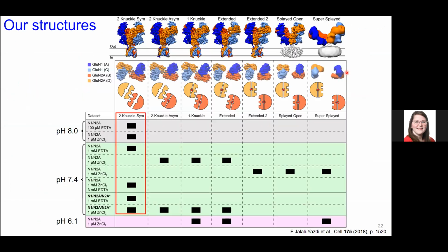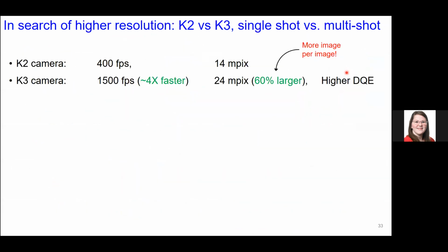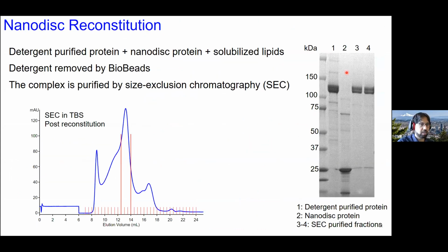Another question was, how efficient is the nanodisc incorporation? Say, are 80% of receptors successfully embedded? Good question. I think what I found throughout doing this several different ways is that about 50% of receptors incorporate into the nanodisc. And that includes all the losses that I gathered throughout this process, because normally I do affinity purification, and initially when I was making grids, after affinity purification, I would do size exclusion chromatography, and I would take the peak of that and make grids.